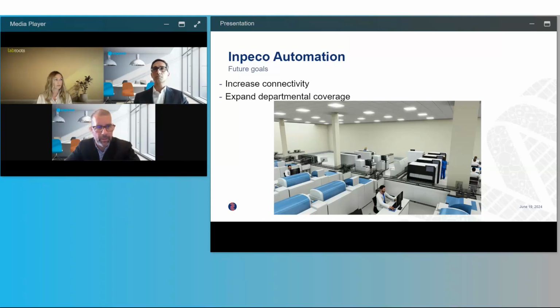We do have the ability to automate pediatric samples today, which is, let's say, often been a sticking point or a barrier to automating in the pediatric space. But there are, let's say, ongoing efforts on both sides to continue to push on our tube manufacturers to have an automation ready, let's say, style of tube for the pediatric testing. Kathleen, like I said, could give more perspective on that. But as far as the Inpeco side of this, that would be my answer.